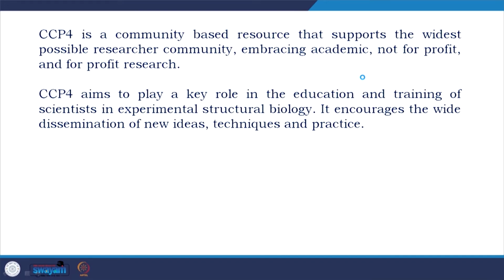CCP4 aims to play a key role in the education and training of scientists in experimental structural biology. It encourages the wide dissemination of new ideas, techniques and practice. Even when I am going through the crystallographic part, especially the software, a lot of these I have also taken from different CCP4 training modules. So, worldwide researchers have taken their presentations, their academic materials, their software, and we as a scientific community are indebted to them.